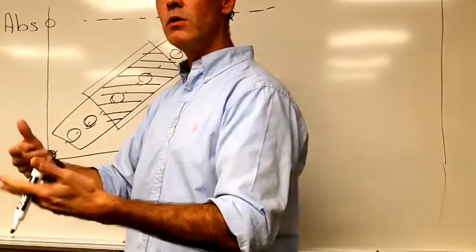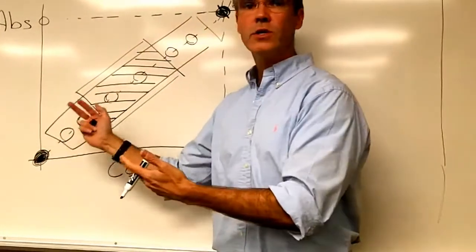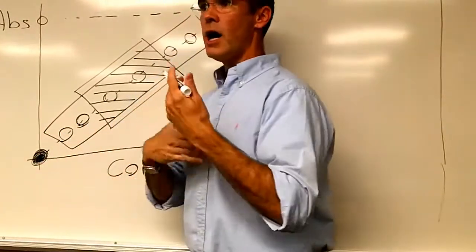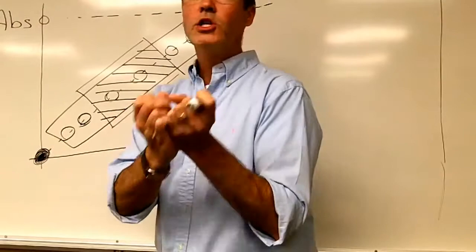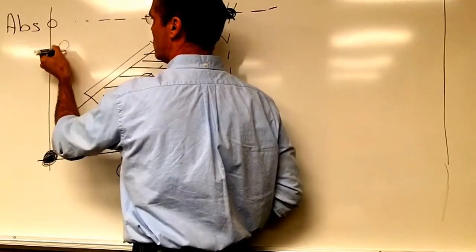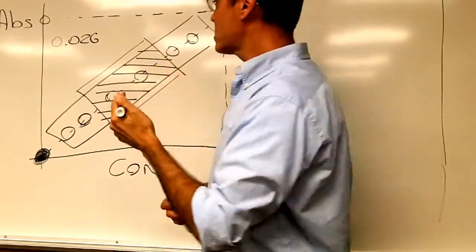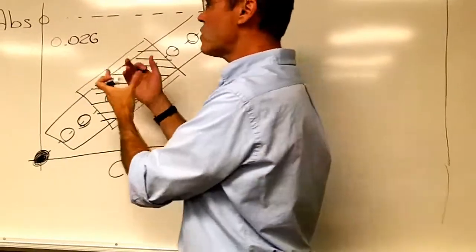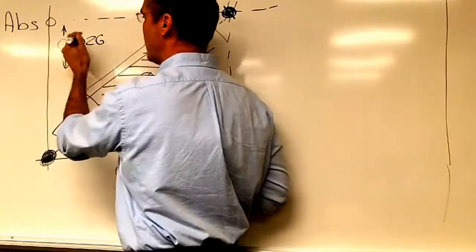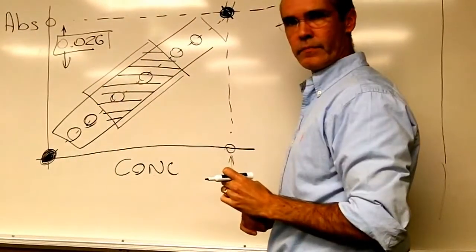You add your molecule that you want to measure, or your standard solution, and you make your dilutions in accordance to what you are measuring. So say that the absorbance that you measure, like your uncolored unknown, gives you an absorbance of, I'm just giving an example, 0.026. Well, your standards, after that, you can dilute them in order to make data points that are higher than this and lower than this, and this one here should fall in this middle part here.